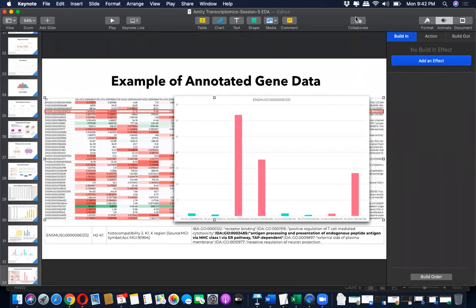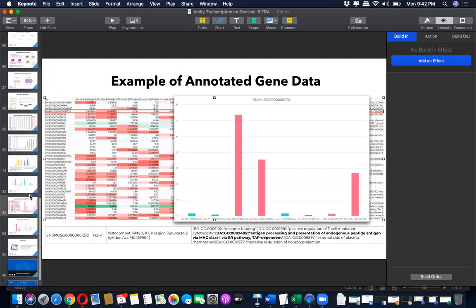Yeah, thank you, Soham. And I think you can also tell them about DAVID, which is a very useful resource to annotate these sort of samples.